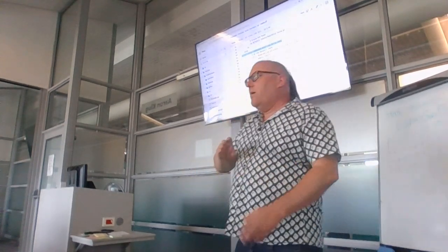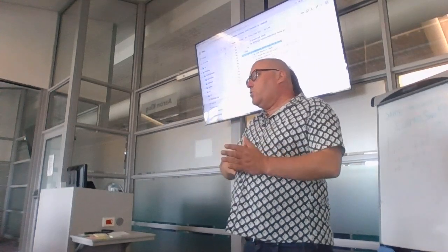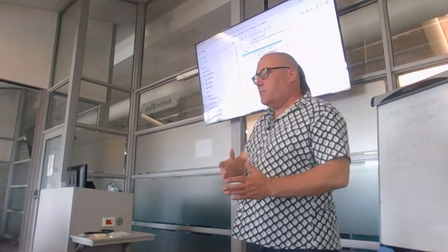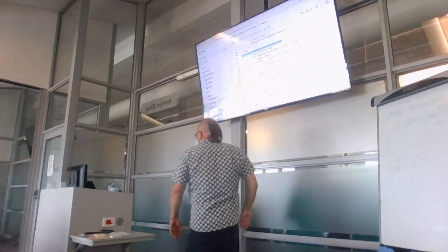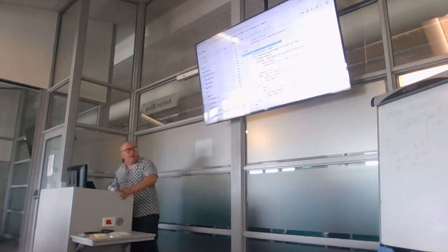It says basically, I want to throw away very short reads and I want to throw away very low quality reads. But NanoQ is doing the same thing. I've never heard of NanoQ, but just reading the code, I can get some idea as to what's happening here, right? Okay, so that's if you're doing quality control on nanopore.